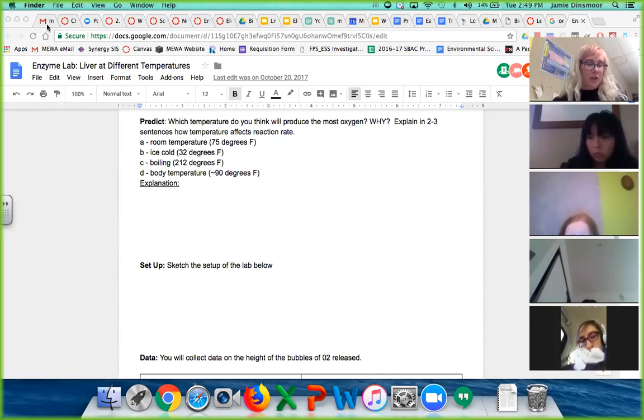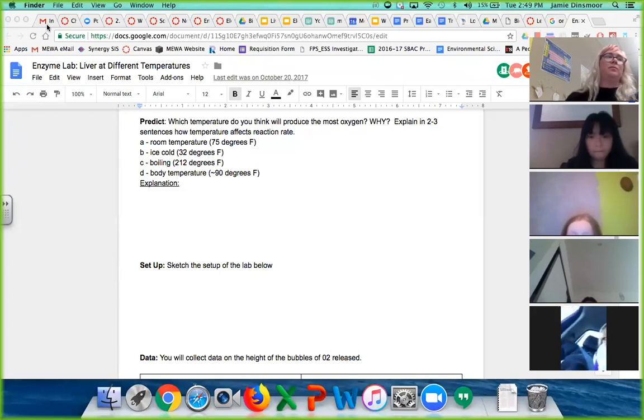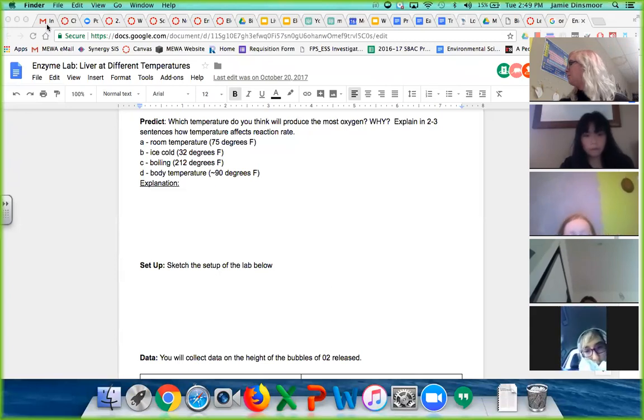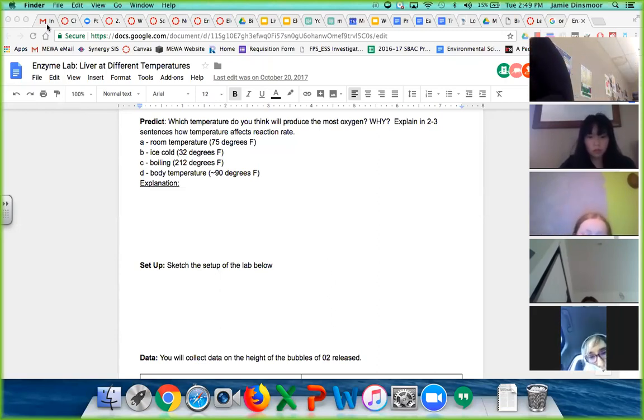All right, let's see some predictions in the chat. What are you guys thinking? Which temperature is going to be the most effective at breaking down the hydrogen peroxide and producing oxygen? And of course, with a reason. Body temp, I'm seeing as a thought. Are people agreeing? Ooh, boiling, Colin says. Okay, anybody else have an idea about this?